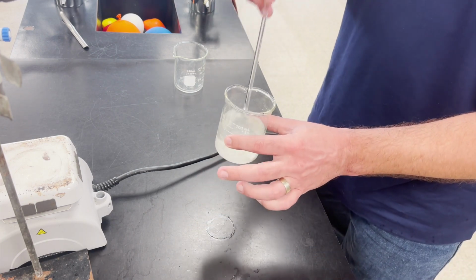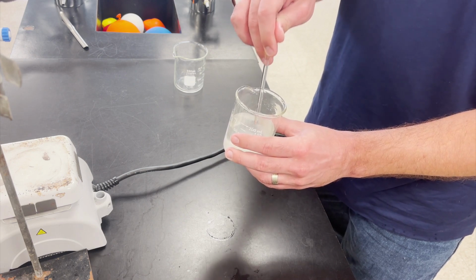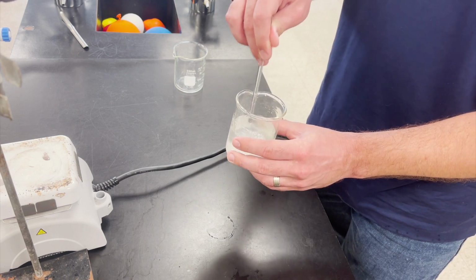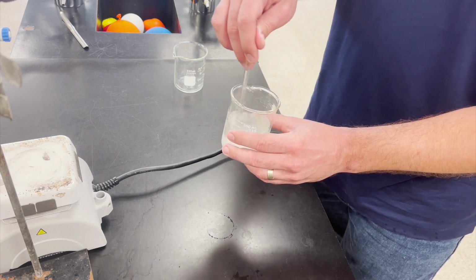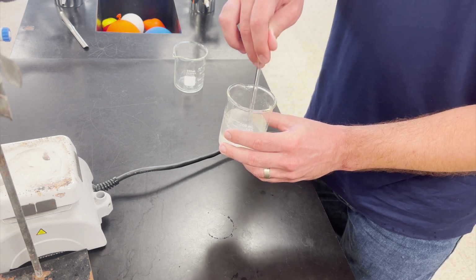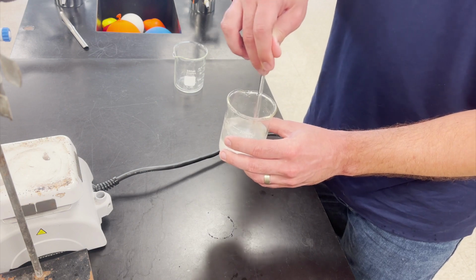There you have it. It is for the most part dissolved. Like I said, some part of the tablet doesn't dissolve in the water. It's the filler, probably stuff like cellulose or something, so it's going to have little floaties in there. That's okay. The aspirin itself, the actual medication, is dissolved in there.